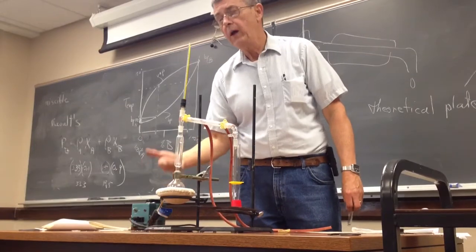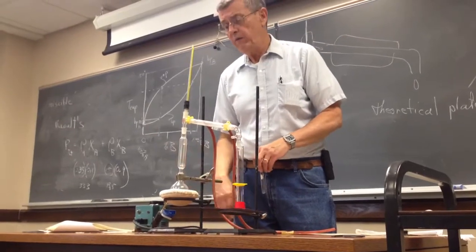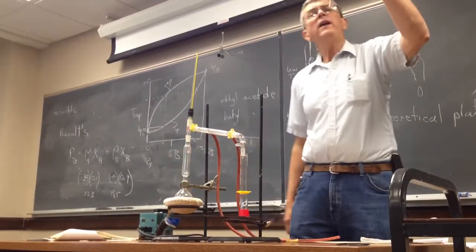Okay, if you adjust the height of this, you'll have to play around with it once you get it put together, but that would work fine for a simple. So simple does not have this, otherwise it's exactly the same. So I get test tubes now.